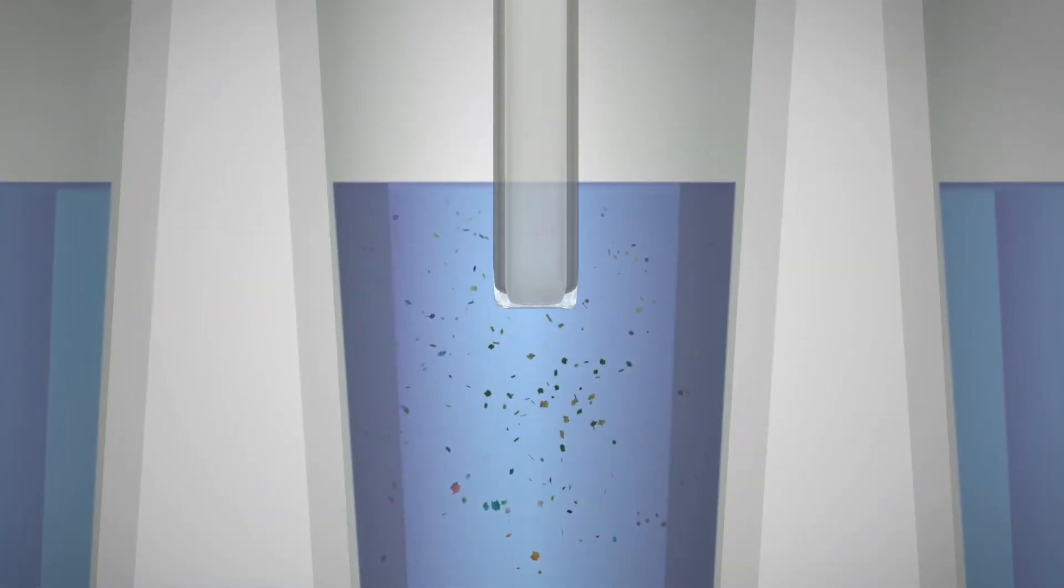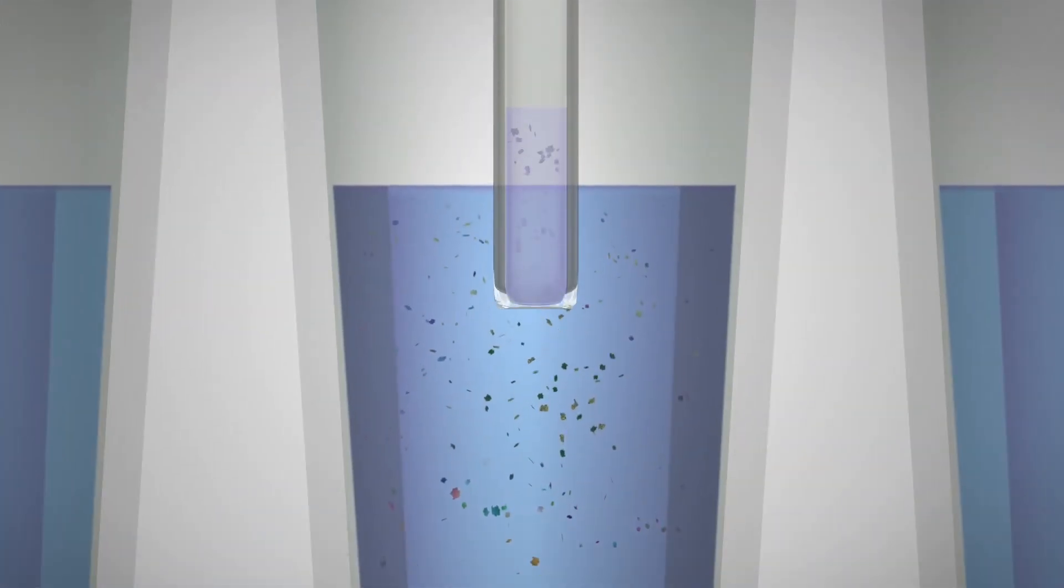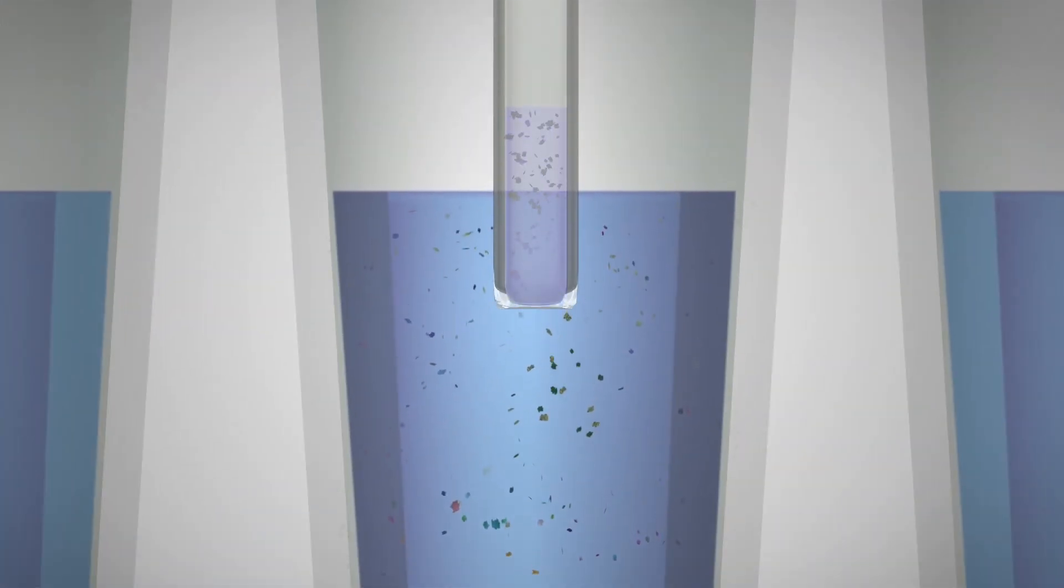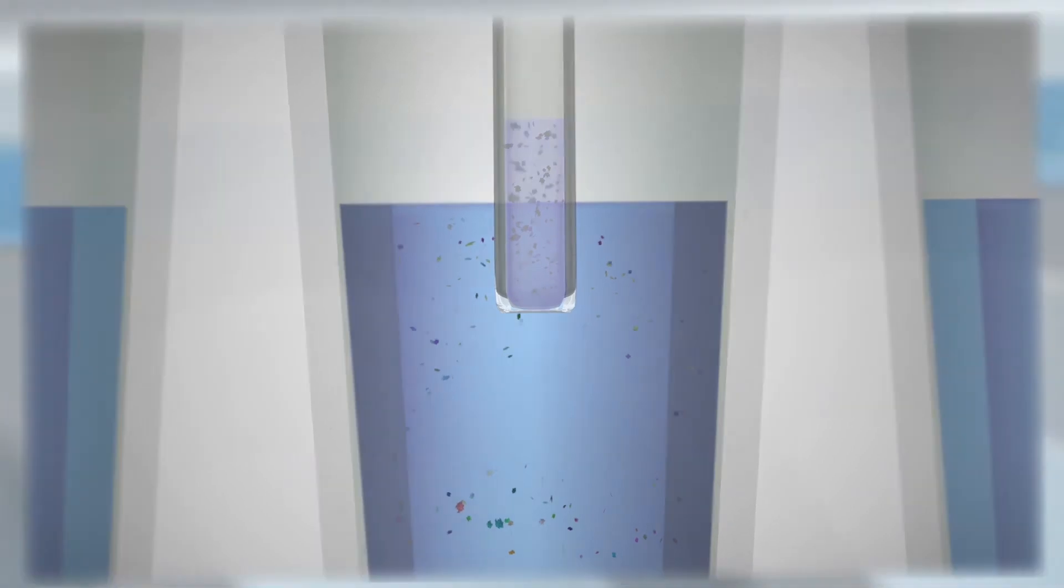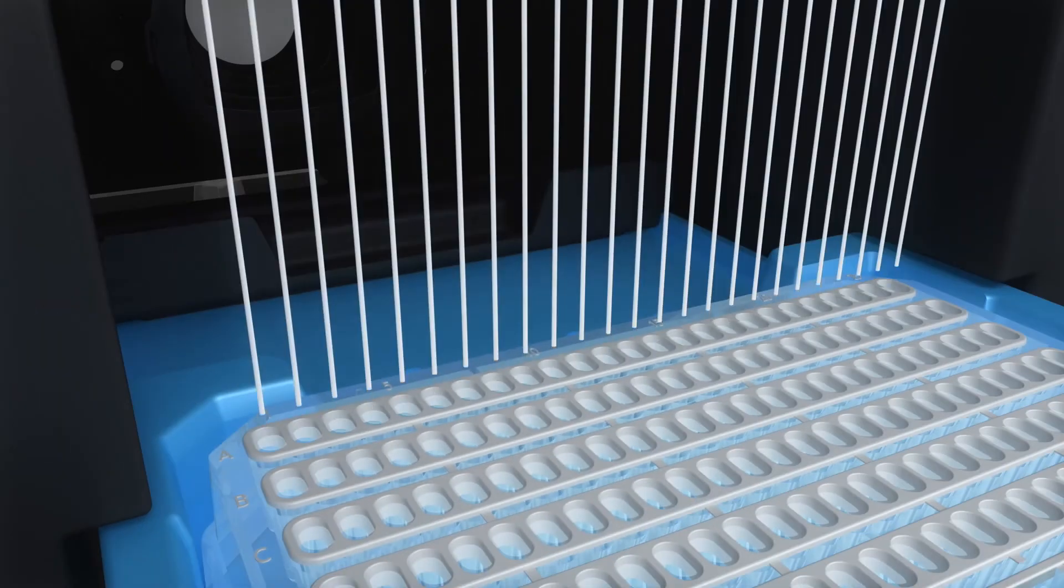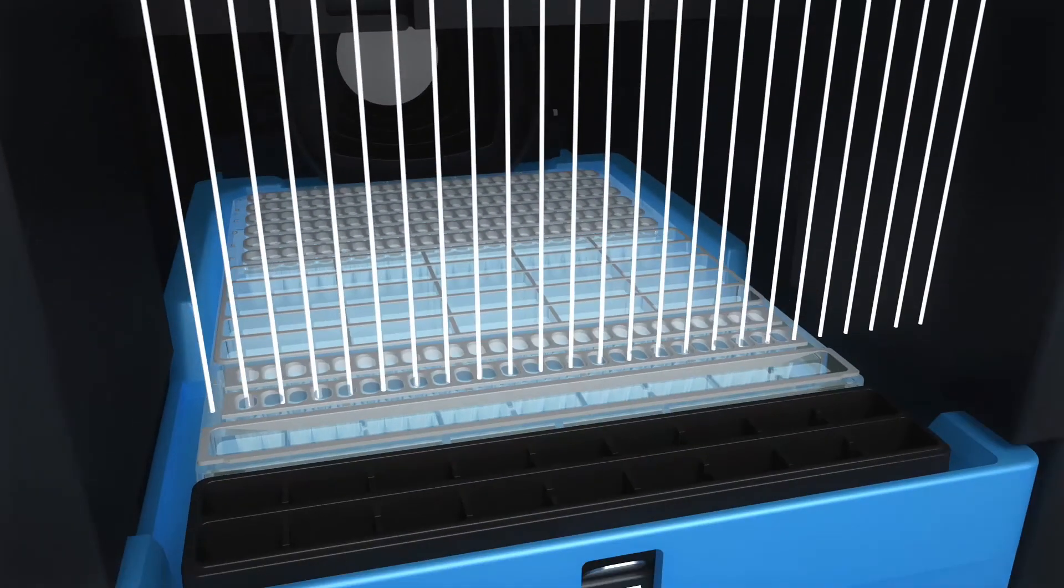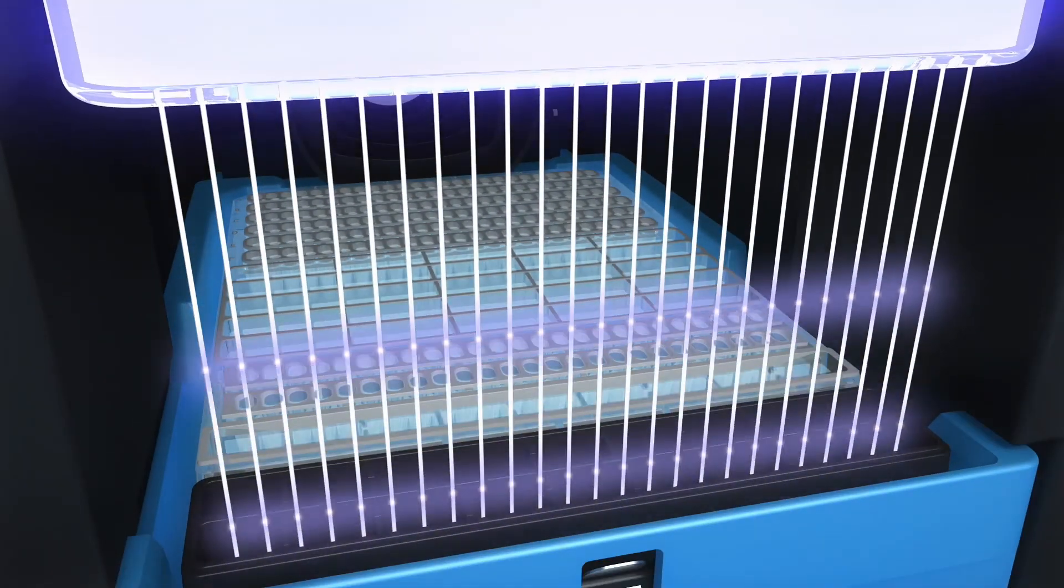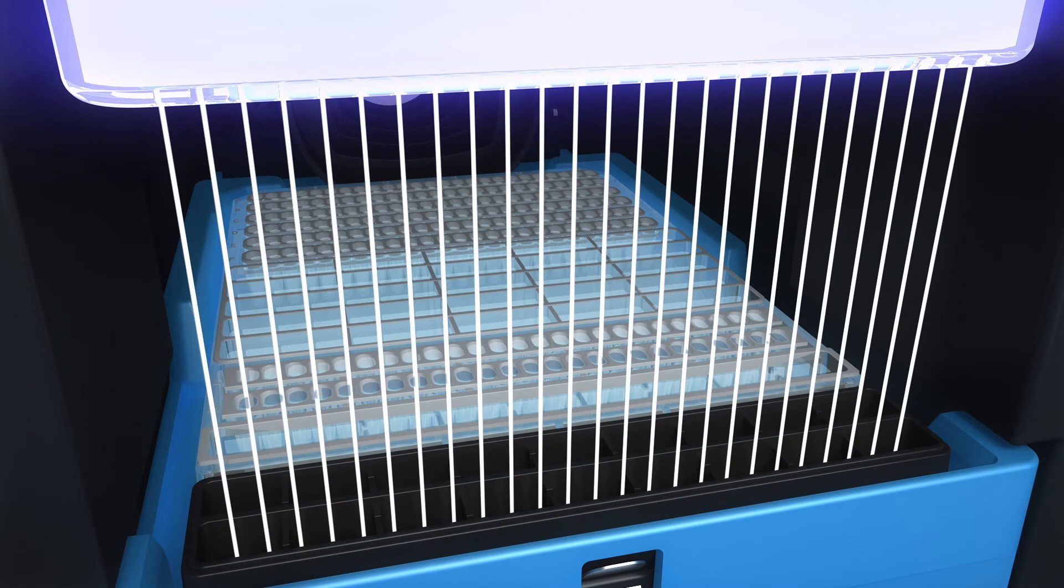Next, your protein sample is loaded and capillaries are lowered to make contact with running buffer. Voltage is applied to separate the proteins by molecular weight.